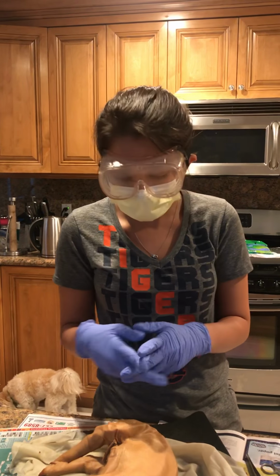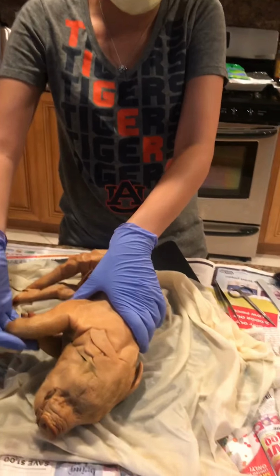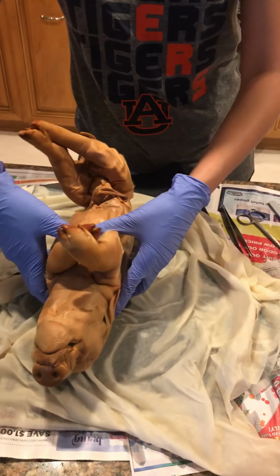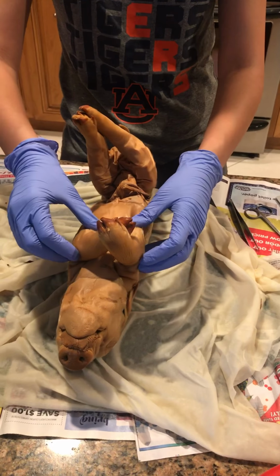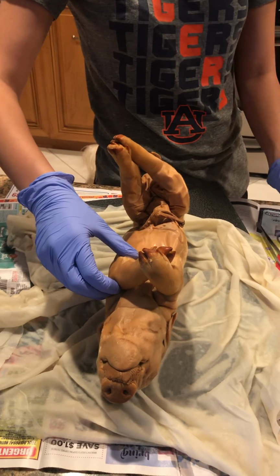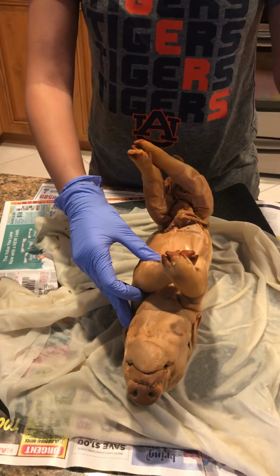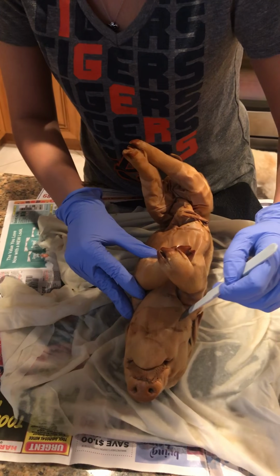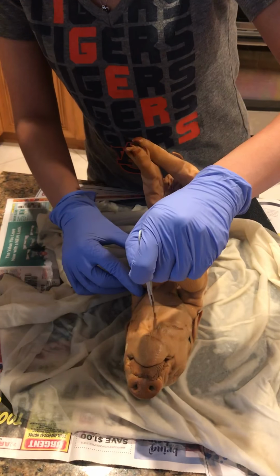If we are going to start the dissection, you want to lay your pig on its back like this, and in our case the head is stretched out, so that's perfect. We're going to start off with the external jugular vein, and if the pig is laying like this, it's going to be to my left. The external jugular vein is going to be right in here, okay? And then we have the internal jugular vein, and that's going to be right in here.